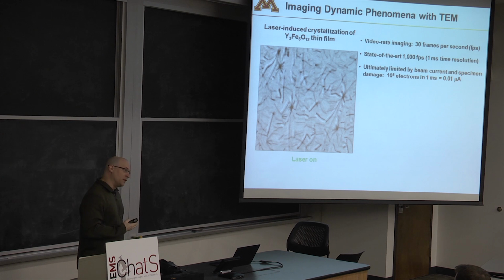There's a problem with this because electrons actually damage the material you look at. Before I said you couldn't image your finger with that first microscope, you actually wouldn't want to, because you're going to burn your finger pretty good. You might end up with cancer down the line somewhere in your hand or something crazy, right? Because it's ionizing radiation. It's going to do damage to the material. And whenever we do electron microscopy on materials, we're damaging that material.